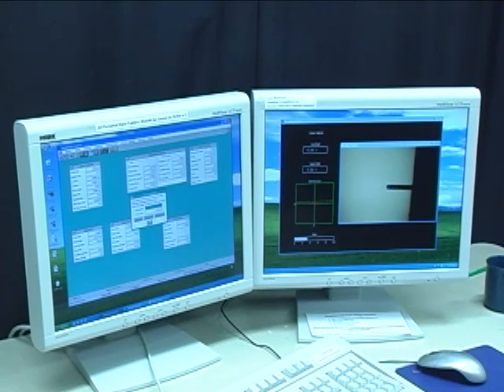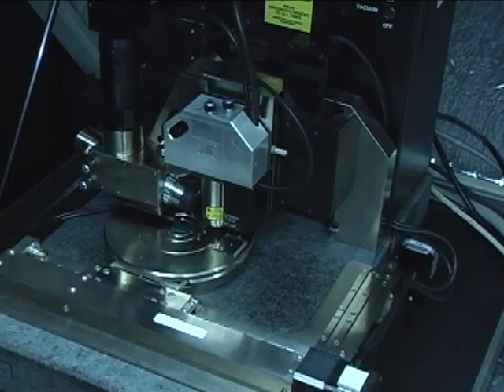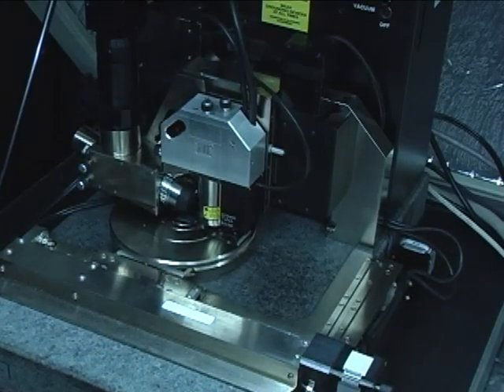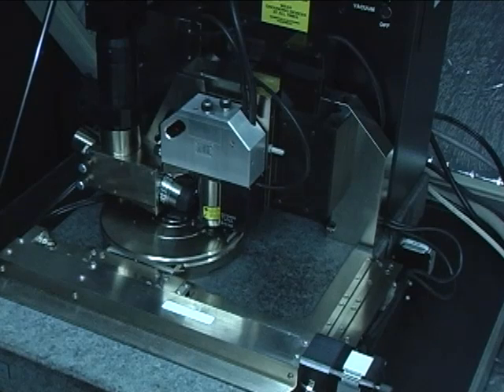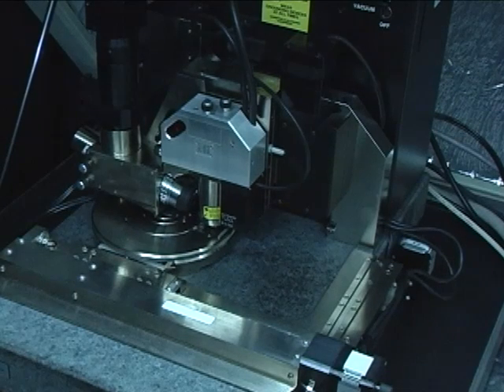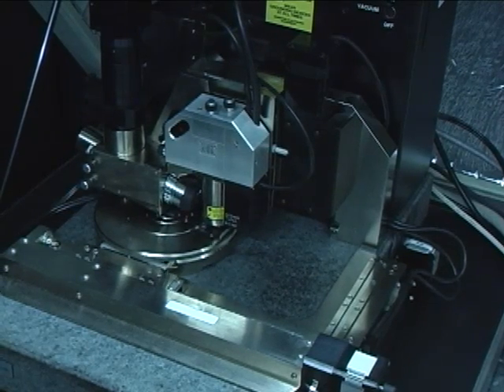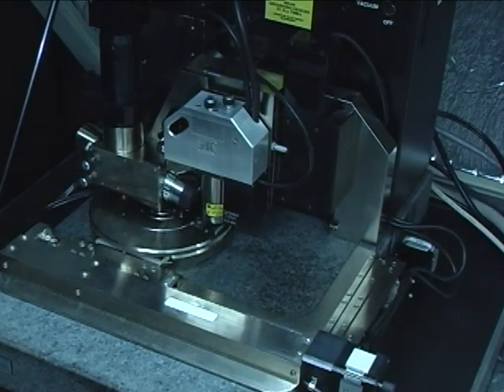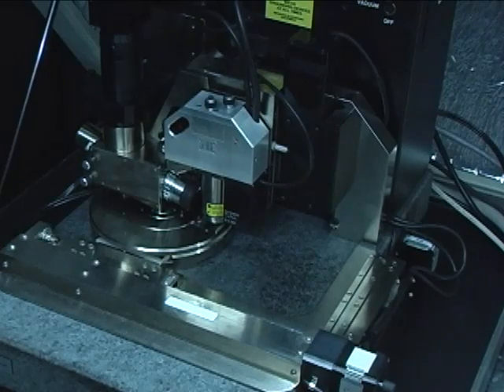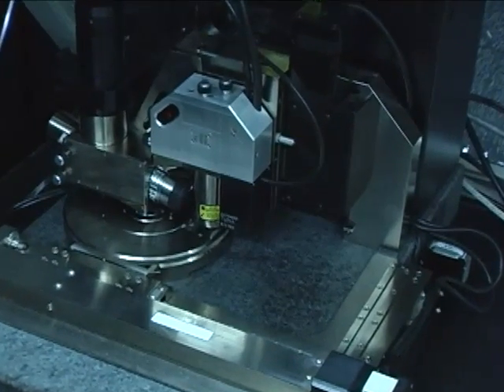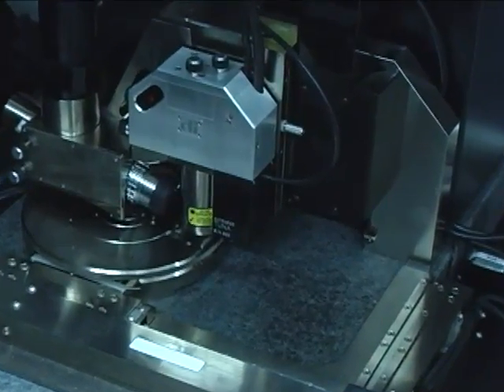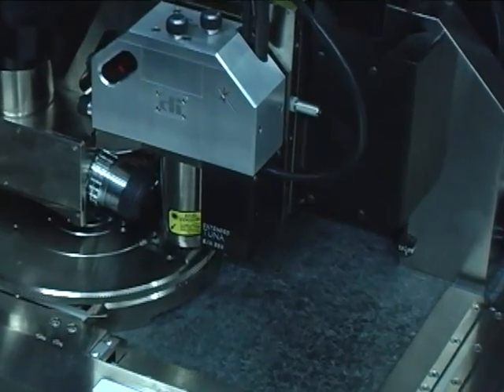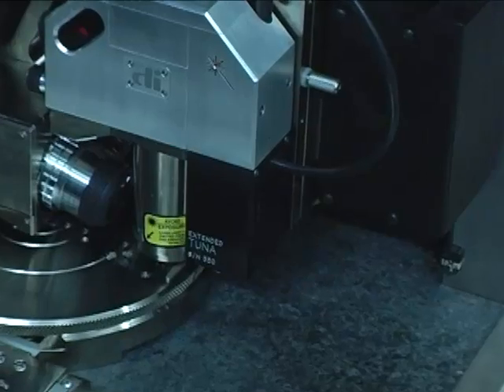So in the focus surface mode, moving the trackball will move the sample mount and allow you to position it beneath your AFM tip. And then using the focus mode will actually bring the microscope head closer into the surface. So usually I will observe by eye and get the tip as close to the surface as I reasonably can.